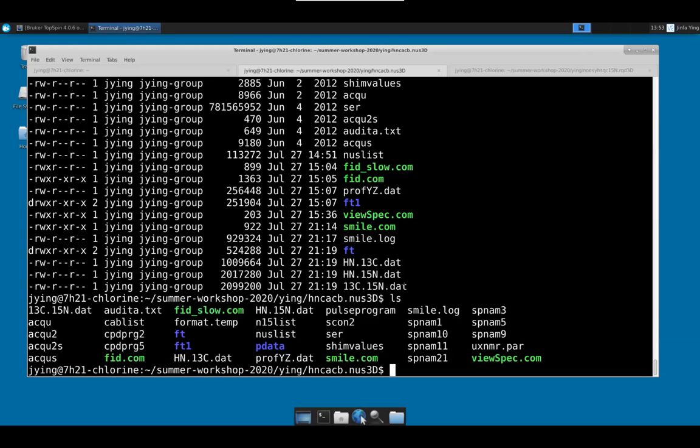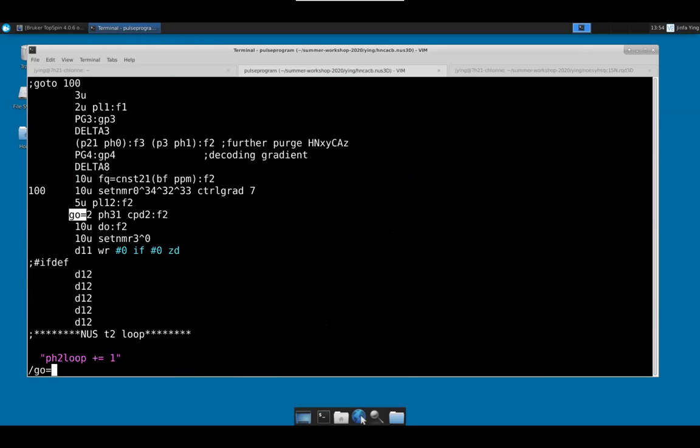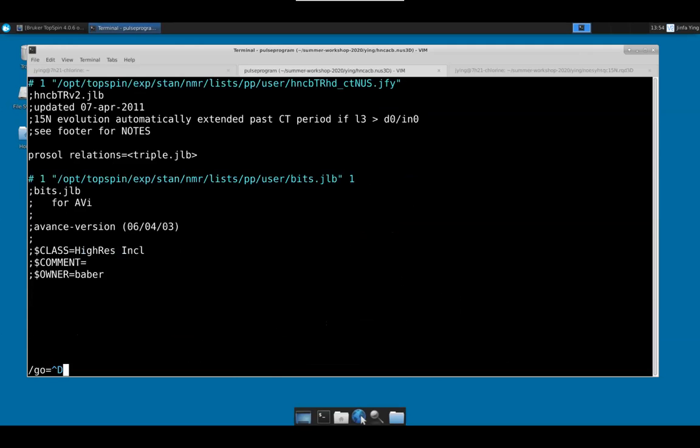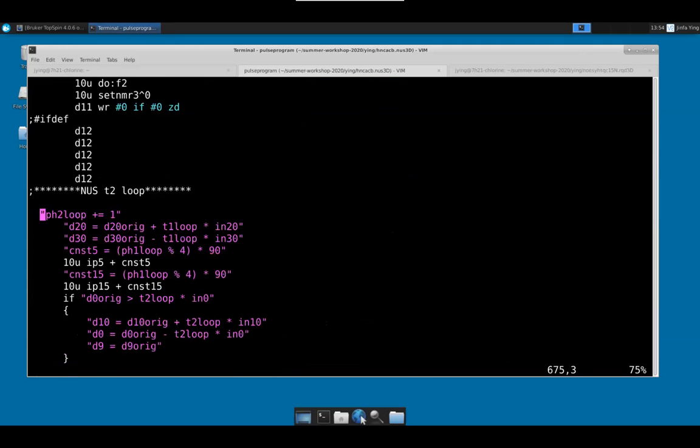So let's move on to HNCACB. It's a conventional HNCACB, and I'll show you how I actually program that. So this is how I programmed it.